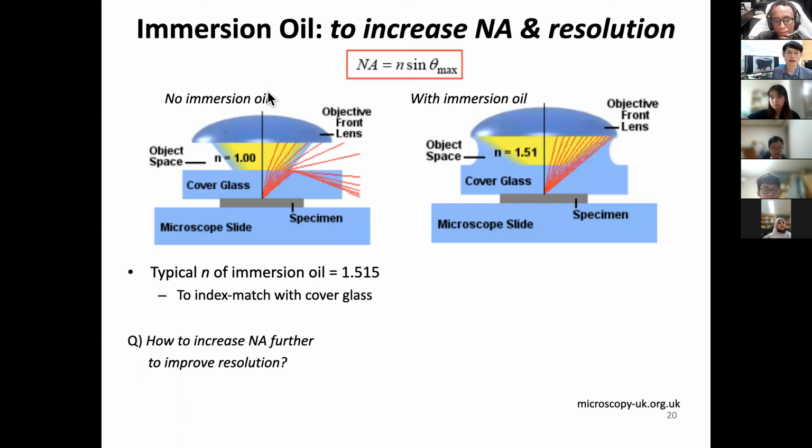This picture shows a schematic of the light which has to pass through the objective lens. This is just a cartoon, don't consider it as a scaled one. You want to see things from the sample. These red lines are the light emitted from the sample. But remember your Snell's law.